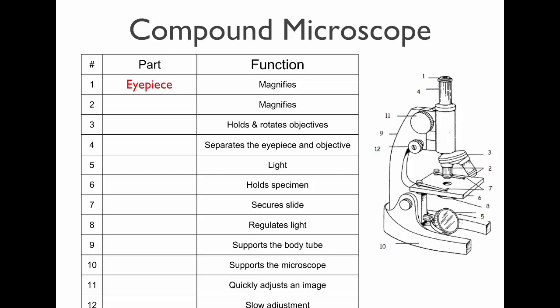Just like a magnifying glass is a lens, or your glasses, your contacts, those are lenses. There's a lens here in this eyepiece. In our microscopes, the eyepiece magnifies the image 10 times. And then we have these lenses. These are called the objective lenses. This microscope, how many objective lenses does it have? It has three. And I can turn this part here that they're attached to, and I could select different lenses that will magnify the image different amounts. This part that I rotate, that's called the nose piece.